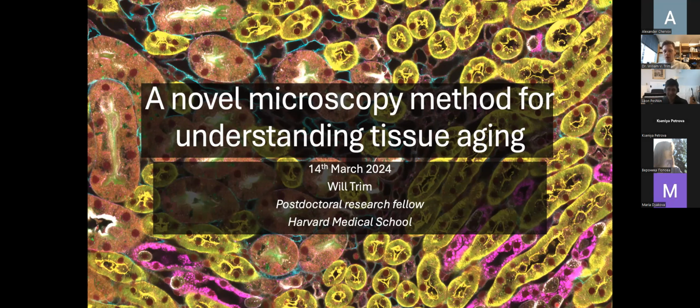This is going to be quite a rapid overview and not too technical of the sort of microscopy that we're using here, which is the only kind in the world of its type, and really looking at the problems we're facing going forward for getting the most out of this technology, and that is particularly in helping us understand aging at the tissue level.